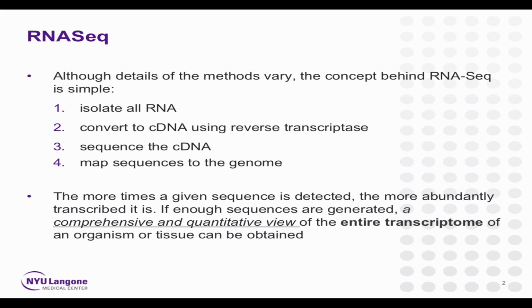So very briefly, what is RNA-Seq? The first thing I always like to say about RNA-Seq is that RNA-Seq is a misnomer because we're not really sequencing RNA. We are isolating all the RNA and converting it to cDNA, and what we're actually sequencing is DNA. There will be future technologies, one of which is Oxford Nanopore Technologies, in which we'll be able to sequence the RNA transcripts directly, but this is something into the future. But we are going to have this instrument in-house. But we're talking maybe a year or two down the line, but I'm just raising the awareness that that's something that's going to be happening into the future.